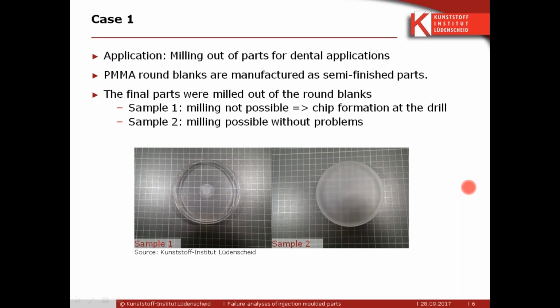And this peak is probably a post-condensation, a post-polymerization of the material. You can assume it, but it's not 100% sure. But that might be the reason for this peak.